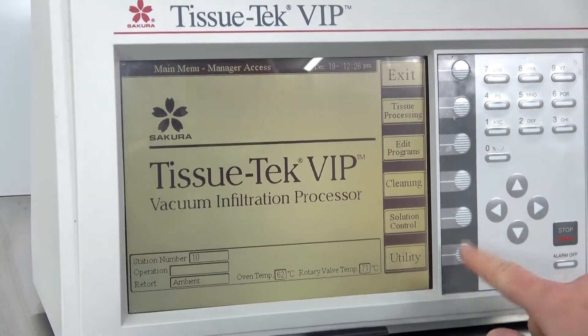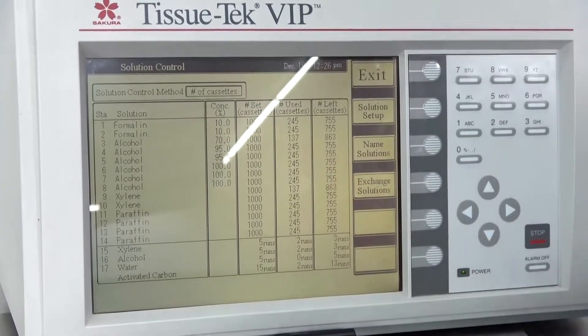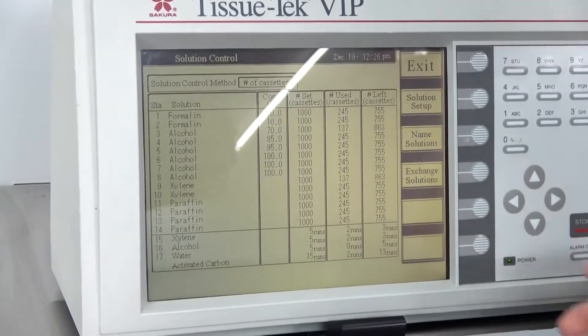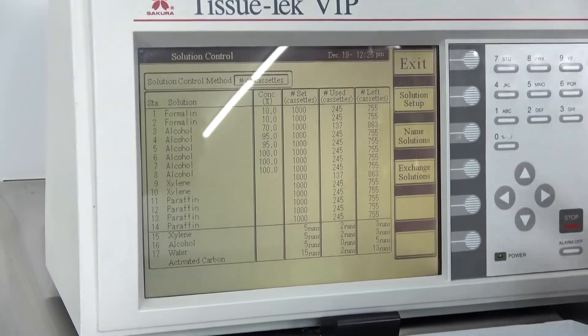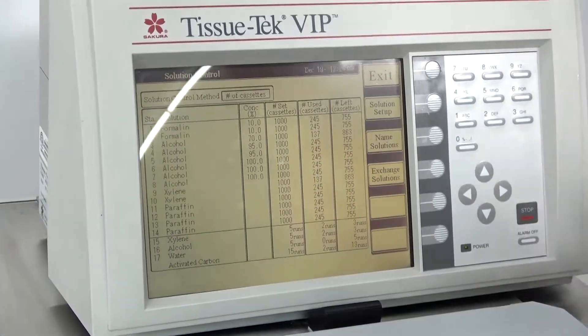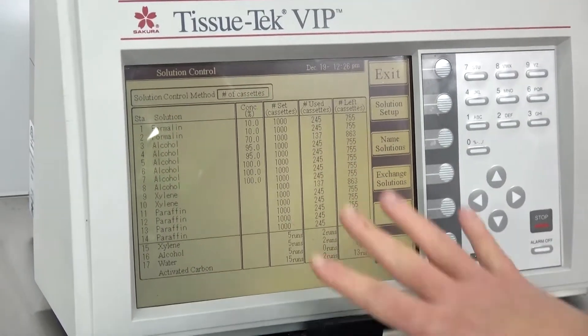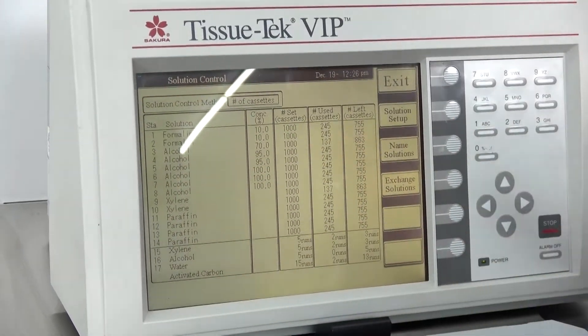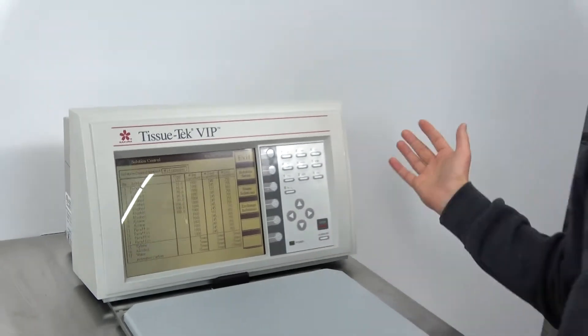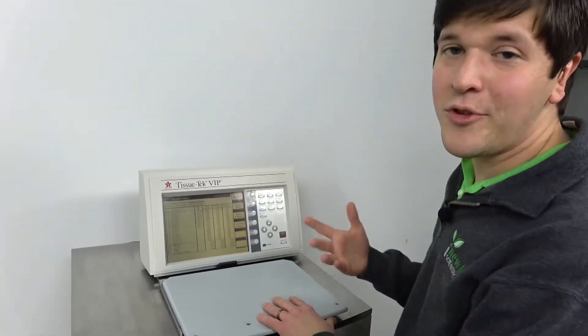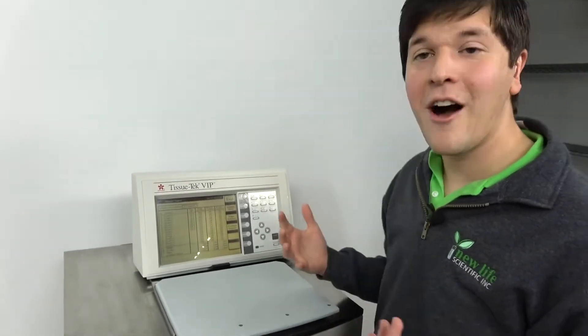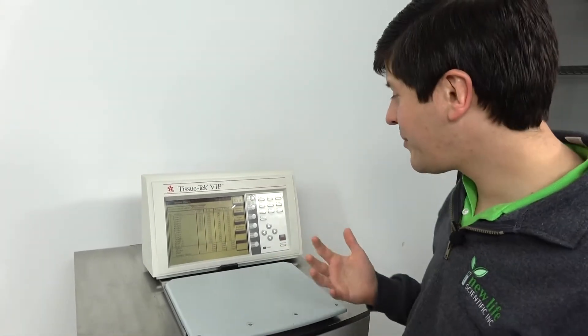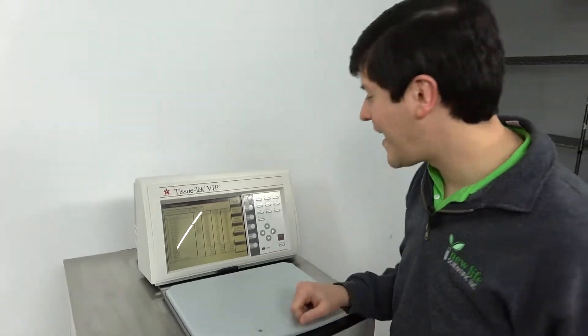So some fun things about this. You've got a solution control feature. You can set how many cassettes you want to run and at what point you're going to change your solutions when you hit that point. So say you want to change your alcohol formula in every 1000 cassettes, you can set that in here. It'll track how many cassettes you've used and it'll alert you when you need to change out your fluids. So that's handy if you've got a process in your lab that you want to maintain and you want to make sure that we're not running alcohol that was used in 2015 on that one sample. That's one way you can avoid that happening.